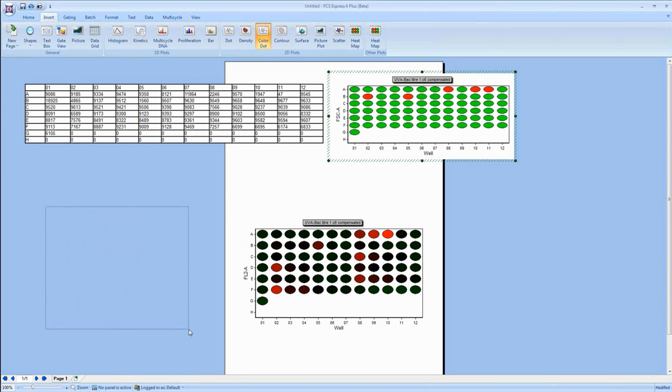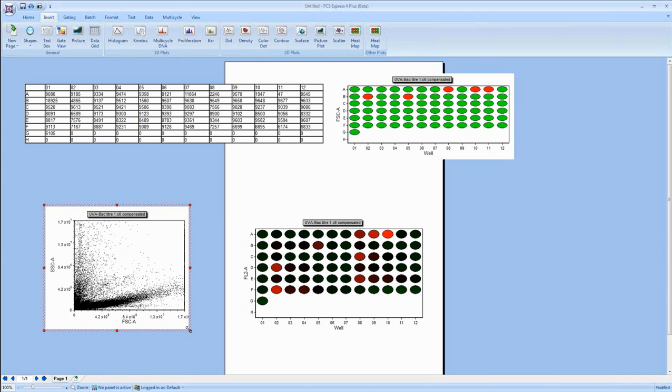So what I'd like to do is insert a dot plot here. And before we go on, I just want to stop again and see if there are any other questions about anything we've done so far. We've talked about essentially all the formatting options we're going to cover today. So are there any questions about that?